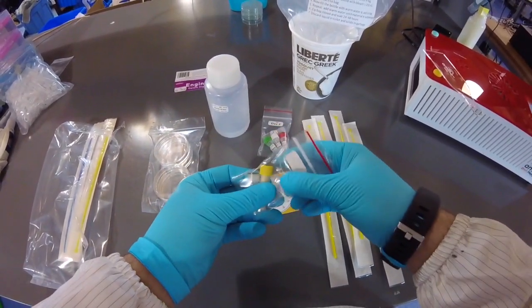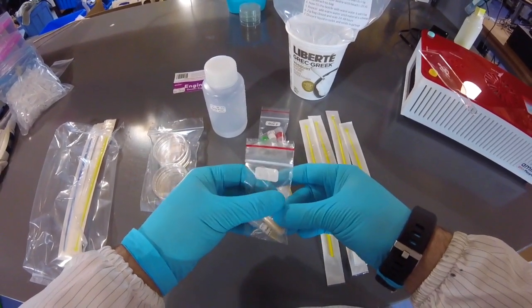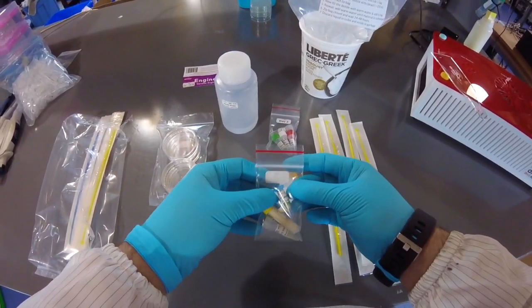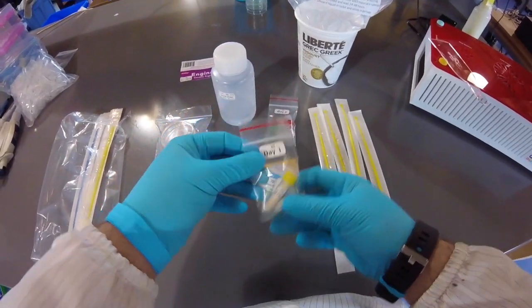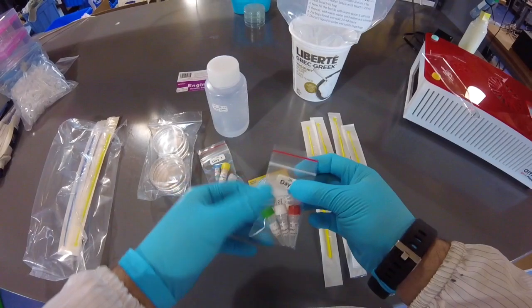And then we've got an antibiotic pill here, and that's because when we do genetic engineering, often we use this methodology called selection so that we can select for our engineered cells. And I'll talk more about that as we go through. This is the day 2 bag, so we're not going to use this today.